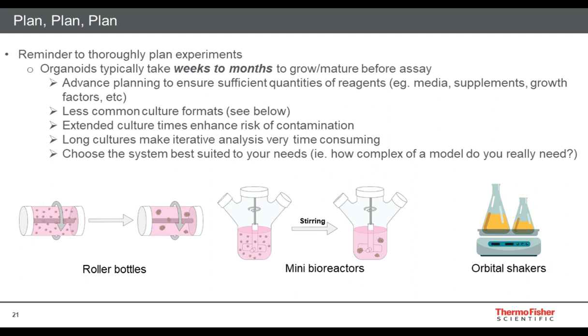So as I wind down here in the last couple of slides, a couple of the other things that are probably relevant or important for people who are looking to get started in 3D, or who have only recently started in 3D, is that these model systems tend to take very long to grow. Some of the cell line model systems are probably much shorter.